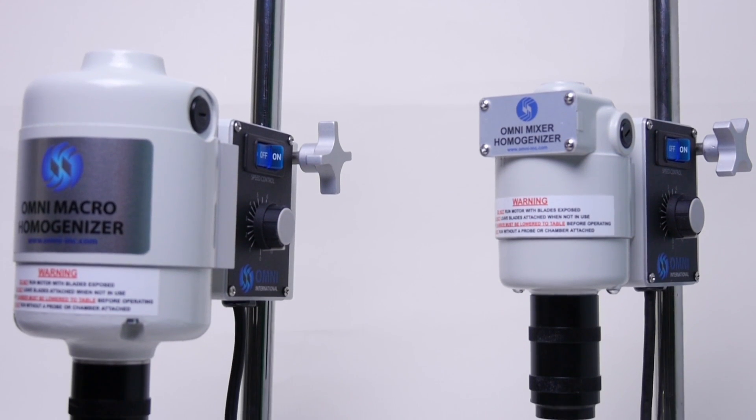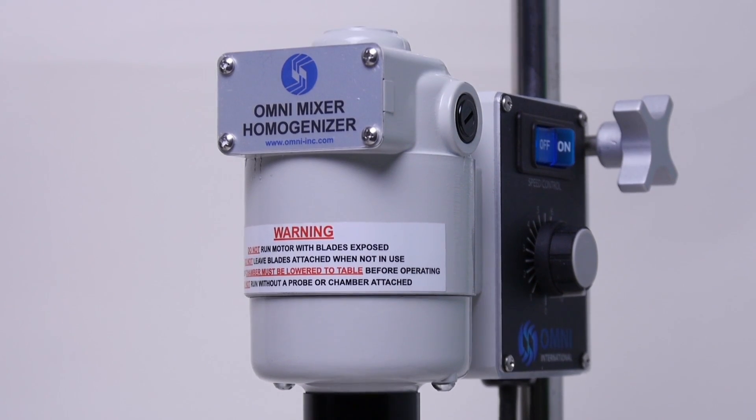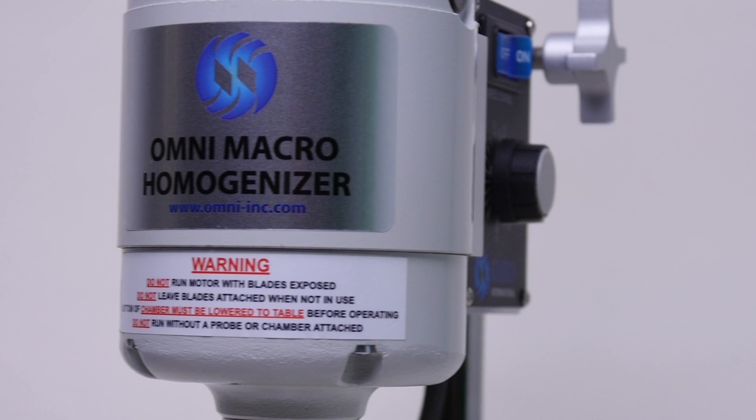The Omni Mixer and Macro homogenizers offer a level of safety, versatility, and performance unmatched by any other homogenizers in their class.